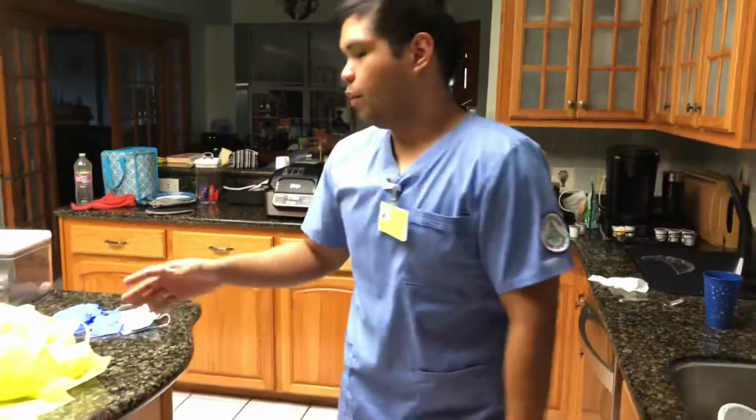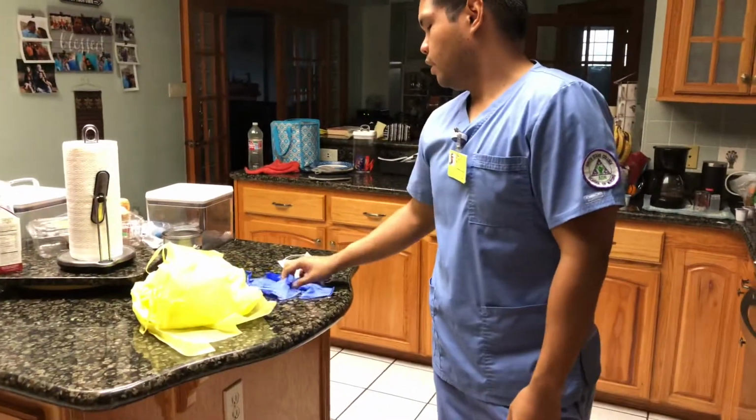Hi, my name is Paul Figueroa, and now I'm going to show you guys how to don and doff PPE. Today we have the gown, we have the mask, and we have the gloves.